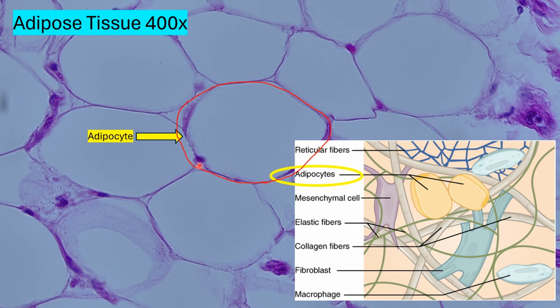One last thing that we don't see much of in this slide is fibers. That is because adipocytes are most commonly found clumped together or surrounded by other components. For that reason, some authors and textbooks might consider adipose as a specialized connective tissue, but we're going to include it here because it really follows how we name connective tissue proper tissue samples.